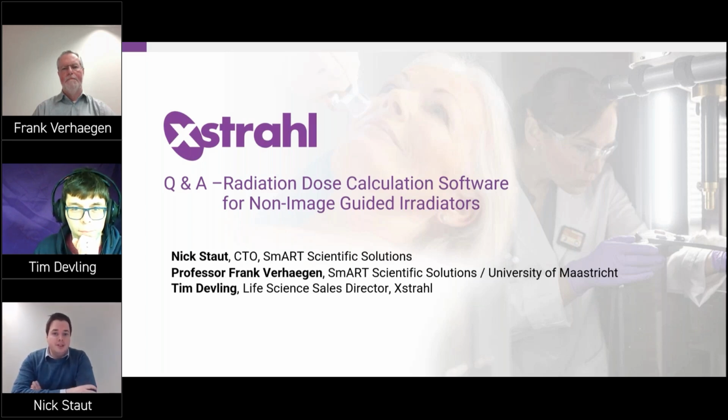We don't have a machine yet, but from the presentation, there was Zhang et al. who had a paper that said around 30% difference for a homogeneous mouse. So I would assume that it's probably even more. Okay, so it could be quite large. Could be quite large, and it's also dependent on what you're interested in. Is it the dose to the bone, or is it the dose to soft tissue, and where is this located?